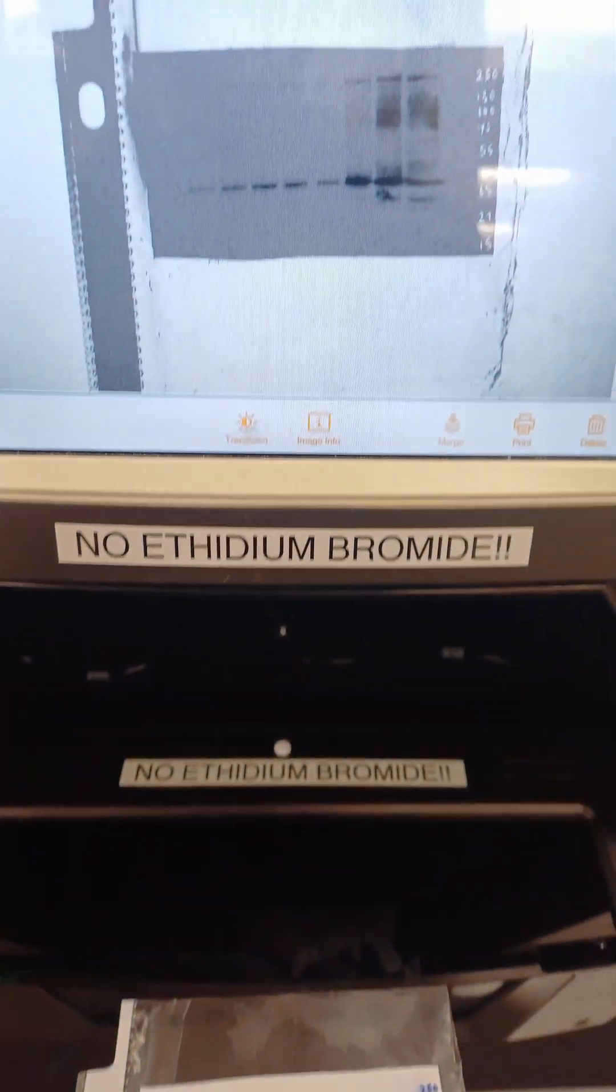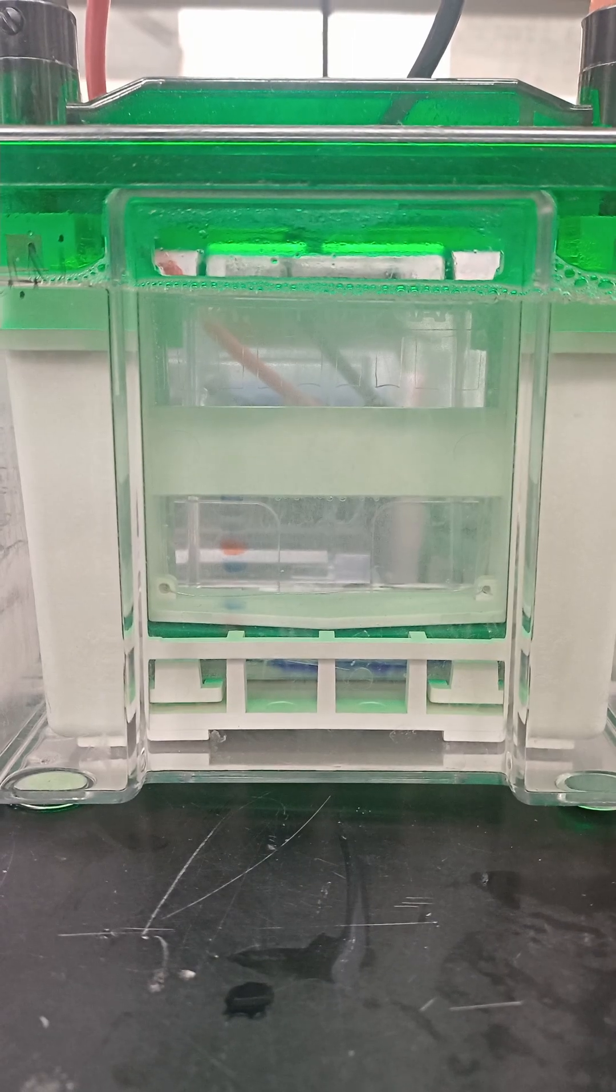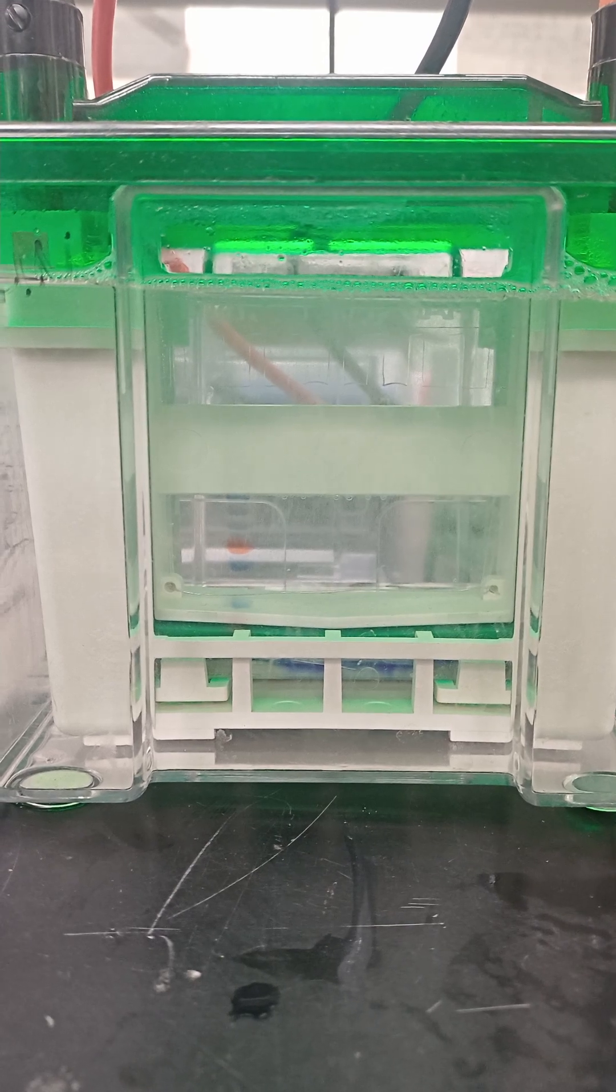Let's walk through how to perform a western blot step by step. We start by running an SDS-PAGE gel and go ahead with the transfer step.